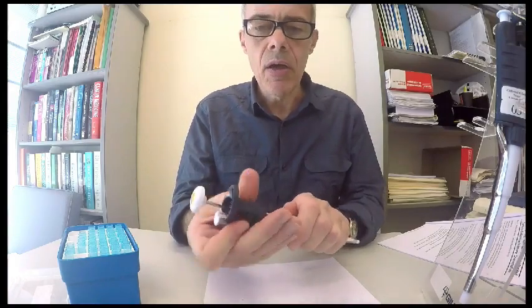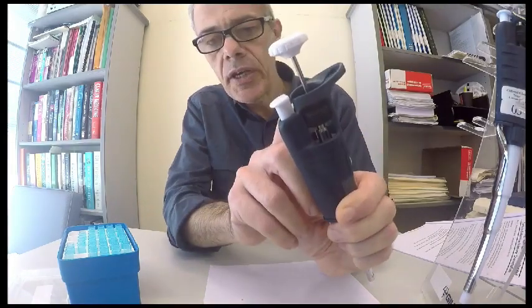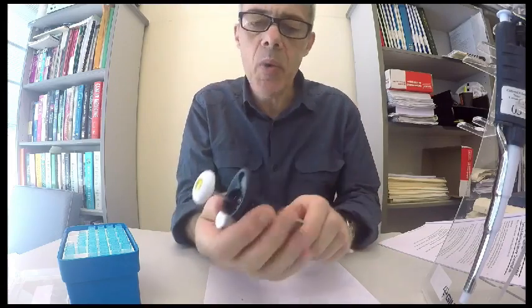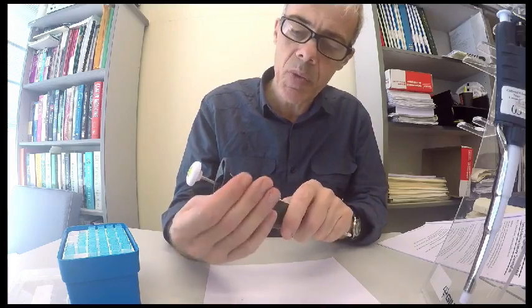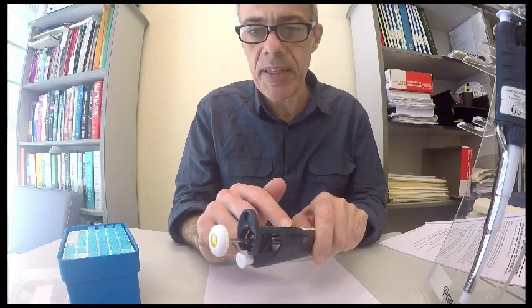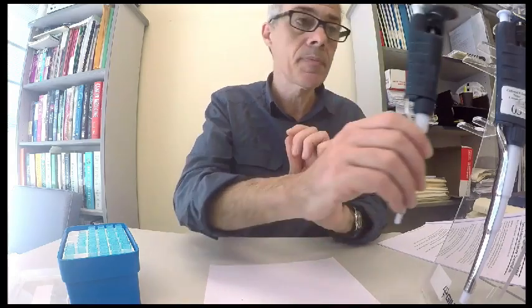So never wind this little wheel here too far up or too far down, and always be aware of where you are on the scale. It's often a good idea to be looking at the scale whilst you're winding and be aware of what the maximum capacity of the pipette is.